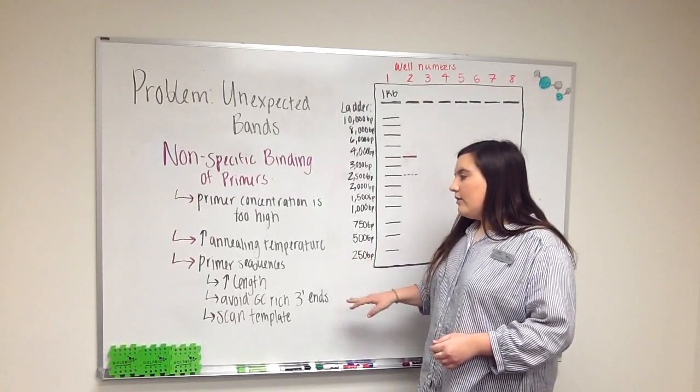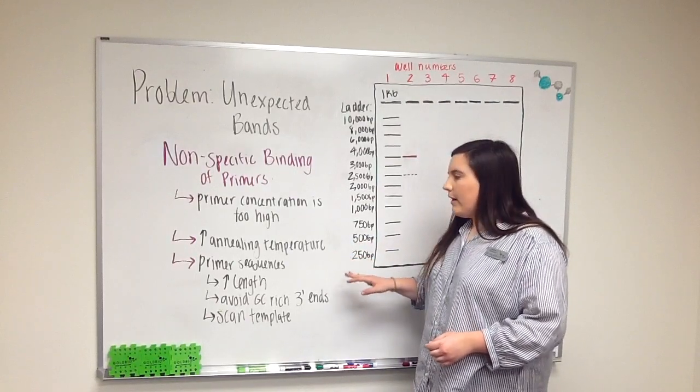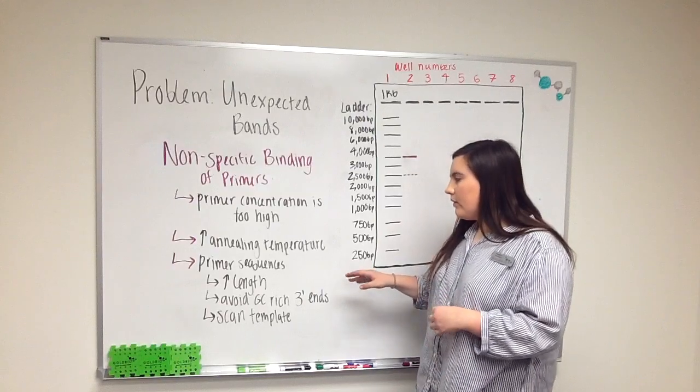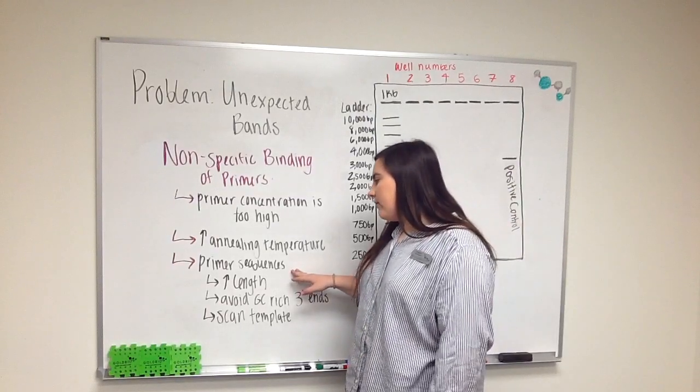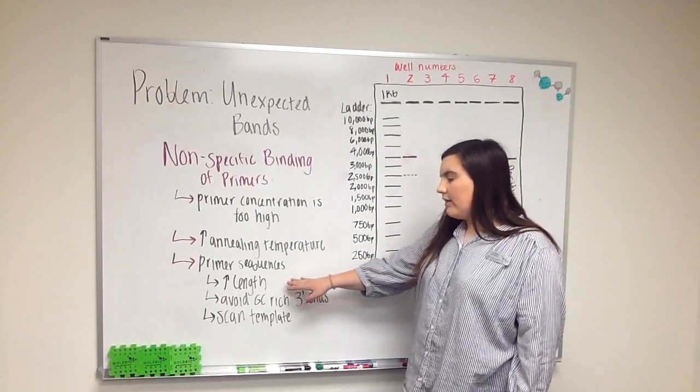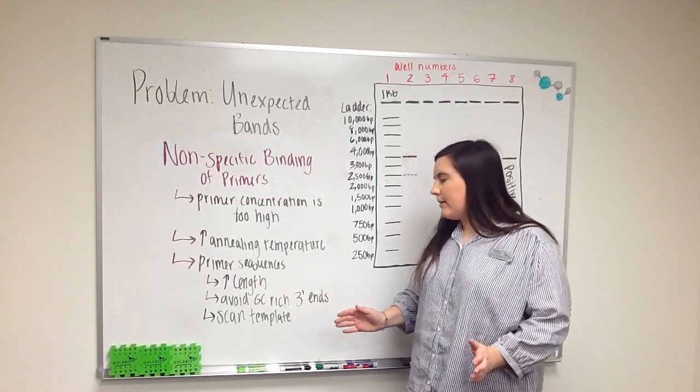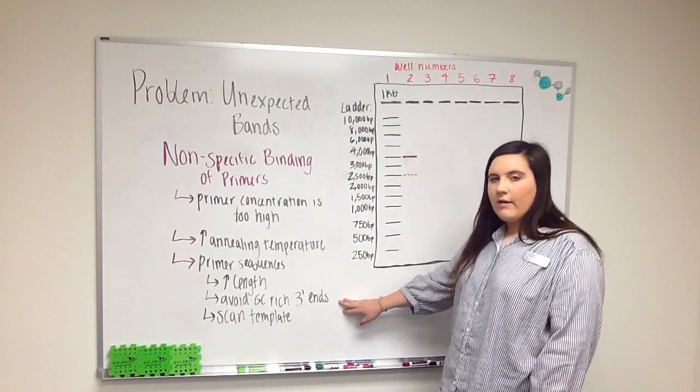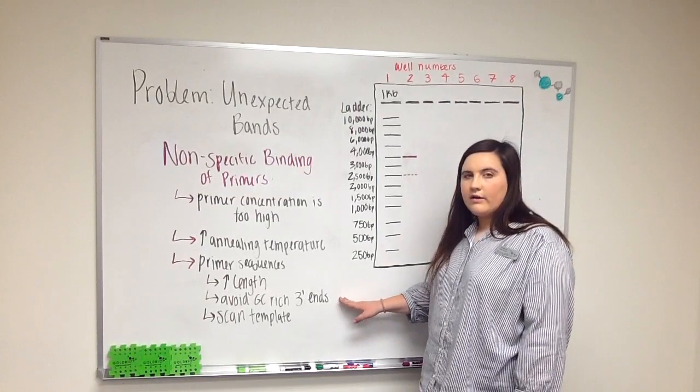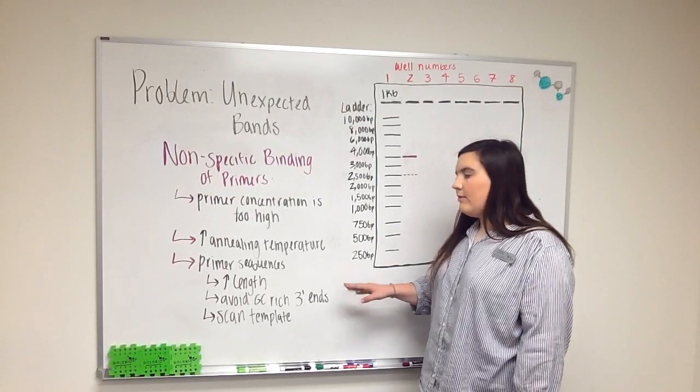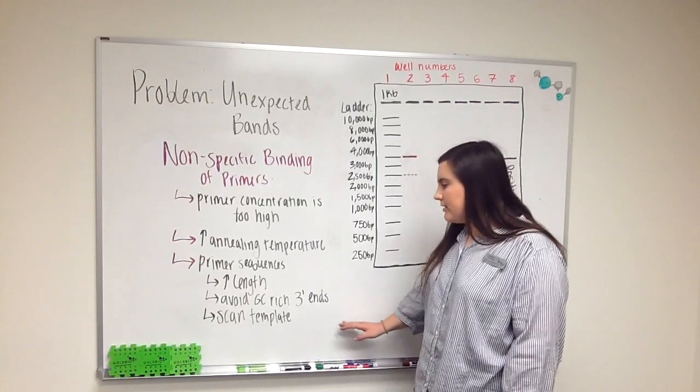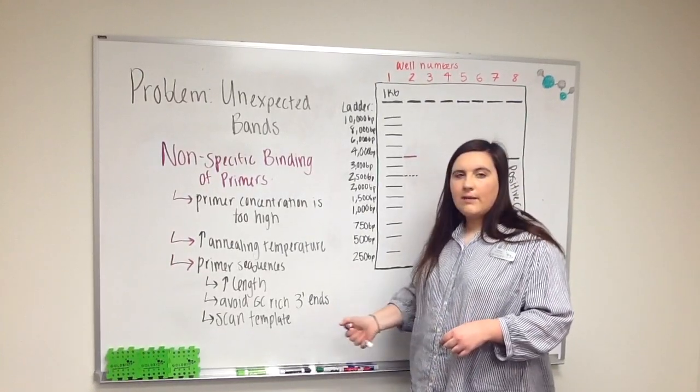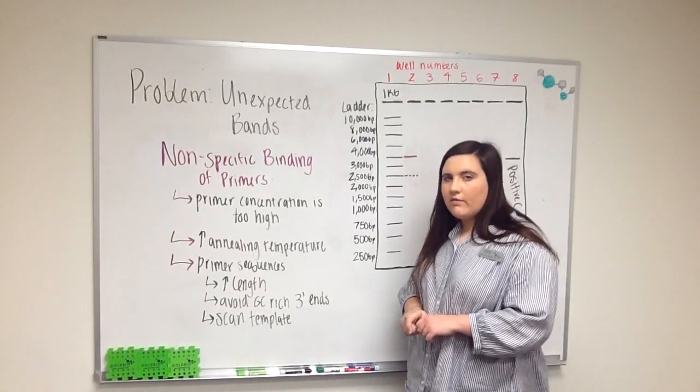You can also try increasing your annealing temperature to make sure your primers are specific. You can also alter the primer sequences and increase the length of the primers to make sure they're binding to the right place on the template. Also, try avoiding GC-rich 3' ends because these could result in secondary structures of the primers, inhibiting them from binding to your template strand. Also try scanning your template to make sure there are no alternate binding sites for your primers.